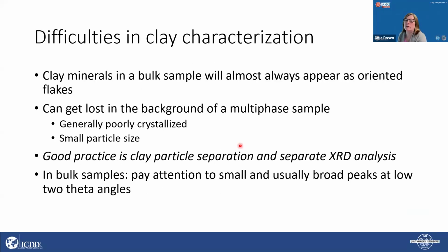So clays are very interesting, but also fairly difficult to characterize. If we're looking at a bulk sample, clay minerals always appear as oriented flakes, and their diffraction patterns are not necessarily well defined. So when we have highly crystalline minerals or materials next to them, we can lose clay peaks in the background.